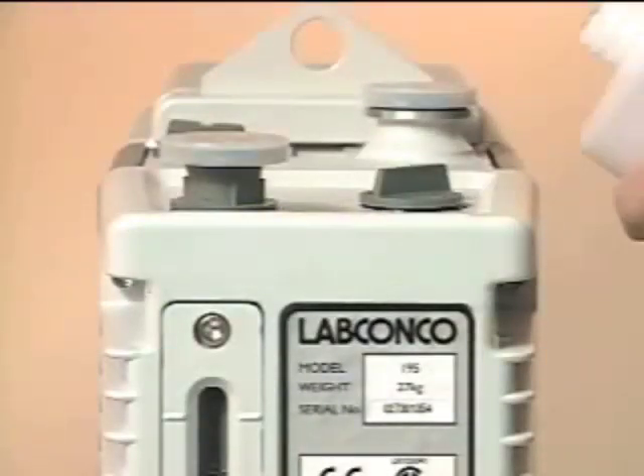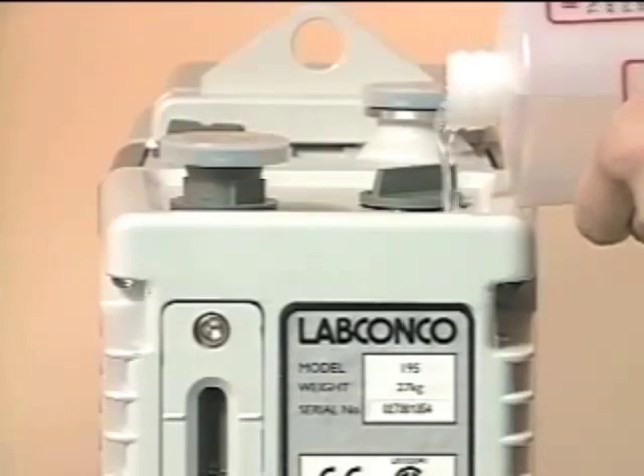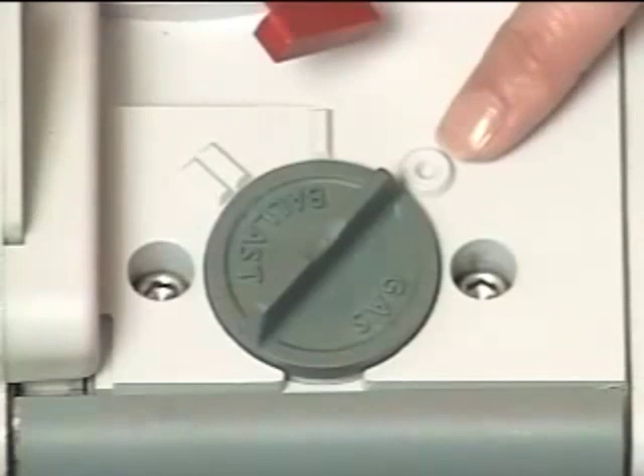Remove one of the oil plugs. Fill it until the oil level reaches the top line of the sight glass. Set the gas ballast to zero.